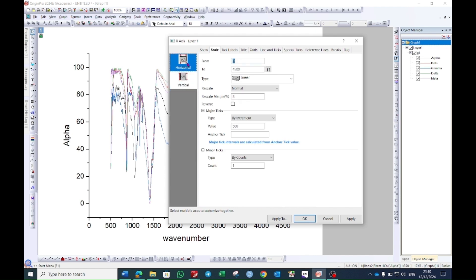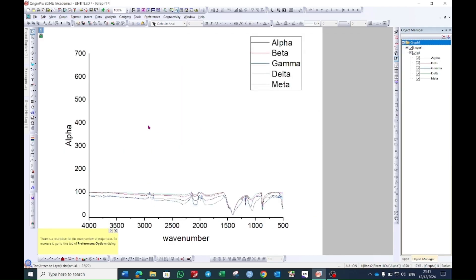This time choose horizontal. Choose from 4000 to 500 or 400 as per your data and then press ok.